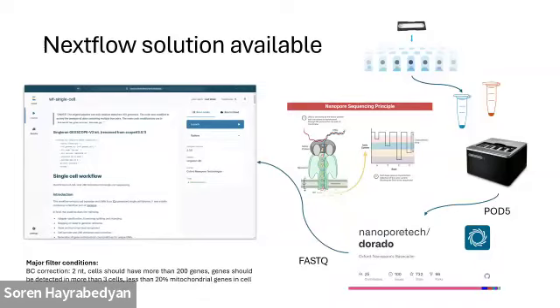So barcoding of cells is very important because by this barcoding, you identify each cell from the others. When the cells leave the chip, you lyse them first, you amplify the mRNAs there, and then all those mRNAs will be put together. So in order to distinguish what is inside, you need to identify each single cell by its barcode, and each molecule by a unique molecular identifier, UMI.